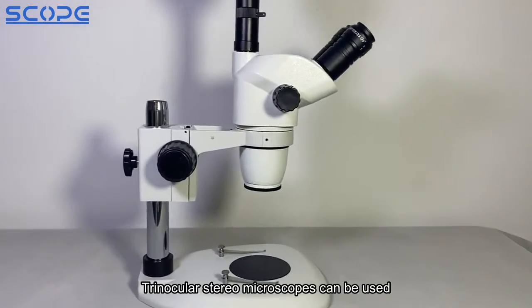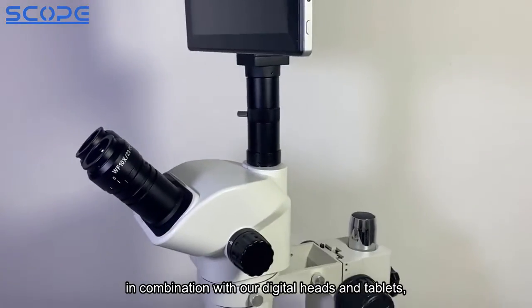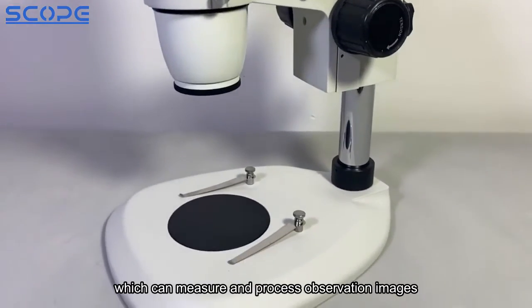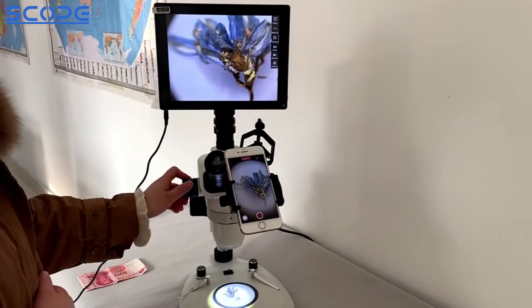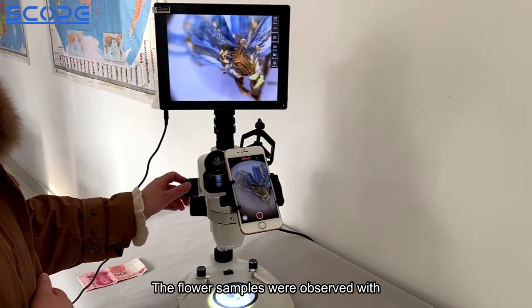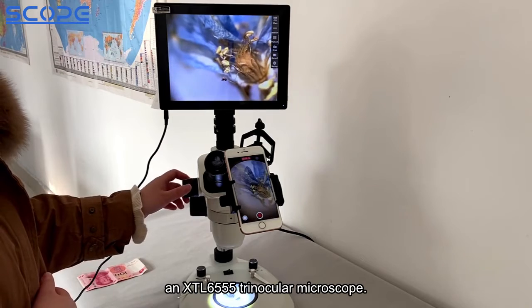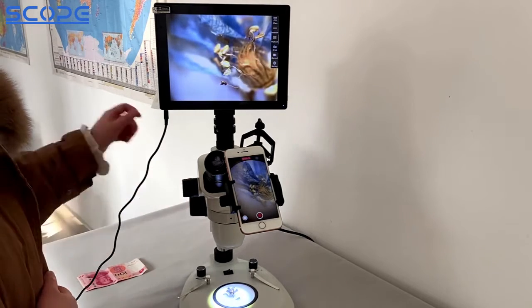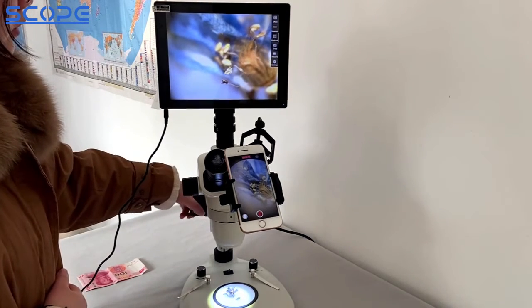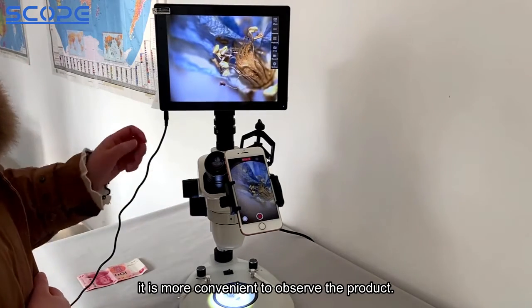Trinocular Stereo Microscopes can be used in combination with our digital heads and tablets, which can measure and process observation images. The flower samples were observed with an XTL6555 Trinocular Microscope combined with the tablet, making it more convenient to observe the product.